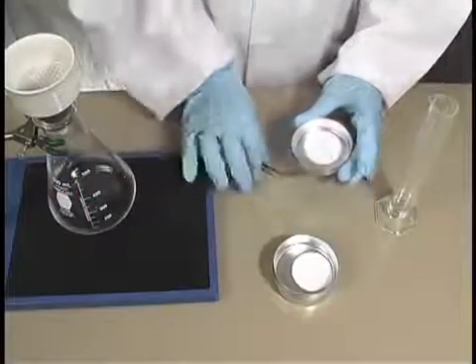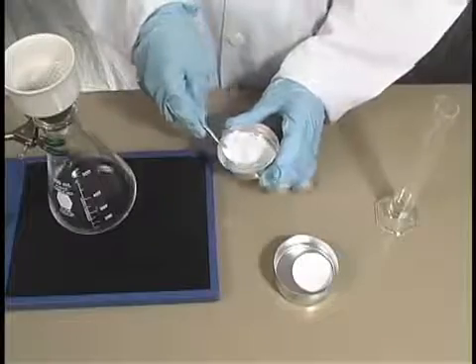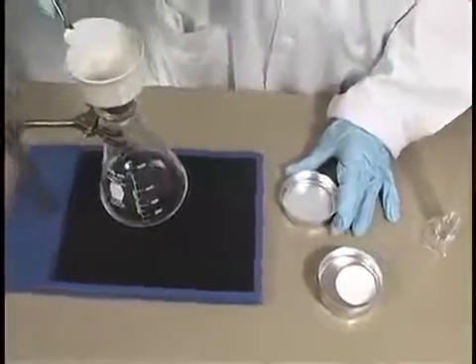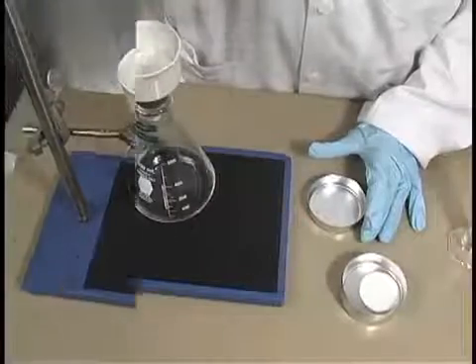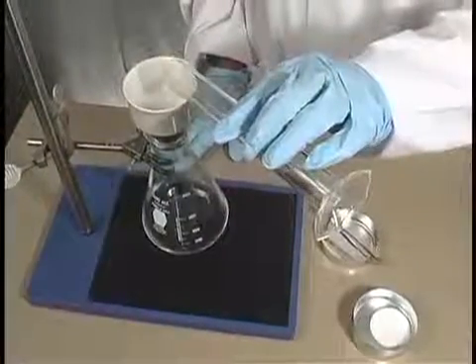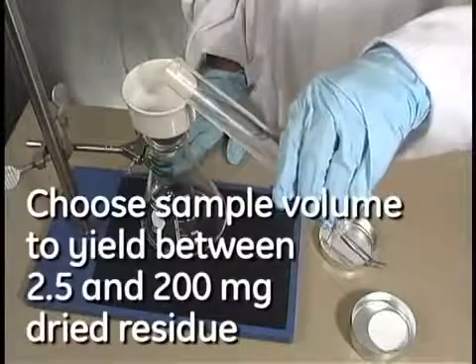Begin by removing one dish from the stack. Carefully remove the filter and place it in the holder, trying to center it. With vacuum applied, wet the filter with reagent grade water. Then pour your sample on the filter.